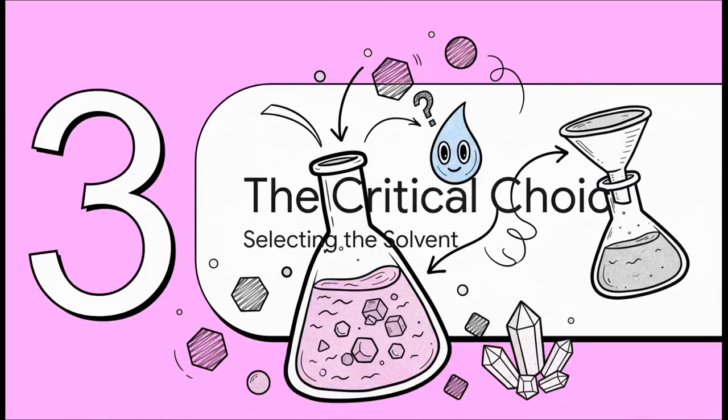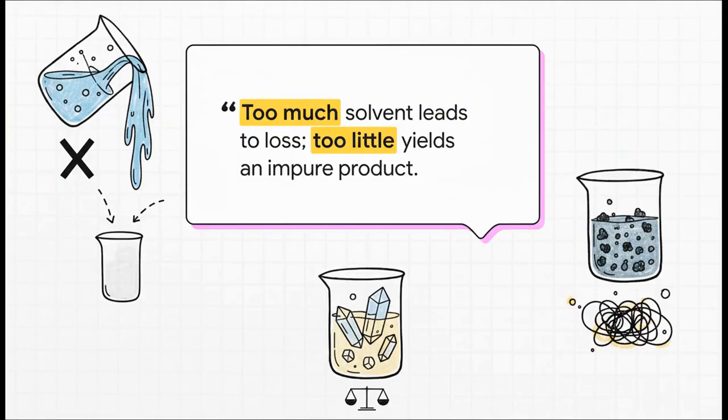But here's the thing. This entire beautiful process hinges on one single critical choice. We absolutely cannot talk about recrystallization without focusing on your most important tool, the solvent. Your success or failure, it all comes down to picking the right one. And this quote just says it all, doesn't it? Choosing the solvent, and just as important, the amount you use is this incredibly delicate balancing act. Use too much and your product will just stay dissolved, even when it's cold. Poof, your yield is gone. Use too little and you'll trap impurities right inside your crystals as they form. It has to be just right.